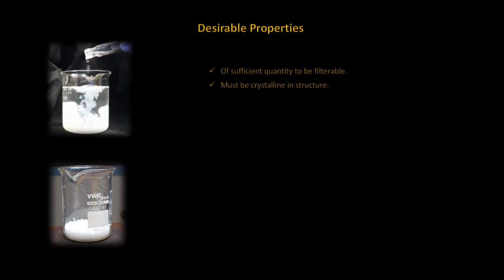The crystalline structure's particle size has to be a sufficient size. Otherwise, a compound may just pass right through a filter during the filter and washing process. It must not be able to redissolve.